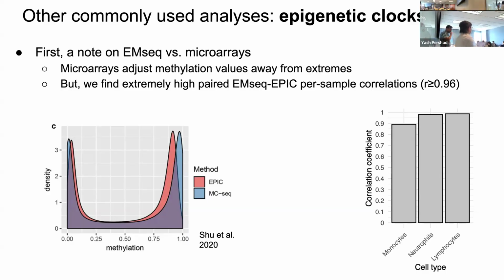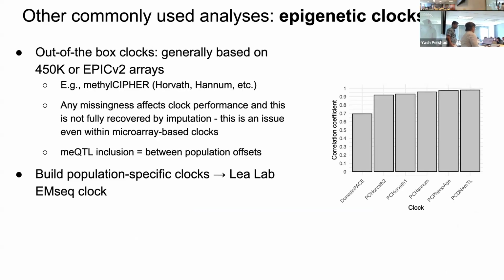So I've noticed hesitancy in a lot of the human genomics world to move beyond the EPIC array, which is massively expensive and gets you a quarter of the data of the Twist panel. But we try to demonstrate that what you get on the back end is very, very similar. And so you're estimating methylation in a very similar way, even though EPIC tends to have higher coverage, but they're compressing all that coverage into a beta value. So you're losing some of that information.